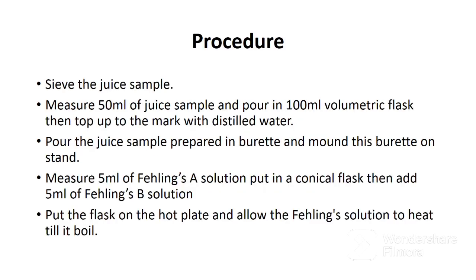Below is the procedure for analyzing reducing sugars in juice samples. Remember, this procedure is the same for all juice samples. I'll use one example — first expressed juice. The first step is to cool the juice, then sieve to remove tiny particles. Remember, if you don't remove them, they can block your burette during the titration. After sieving, measure 50 ml of juice sample and pour into a 100 ml volumetric flask.